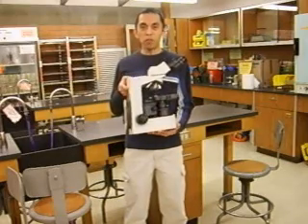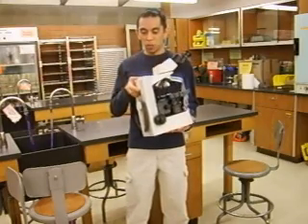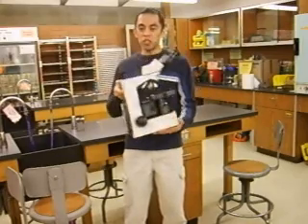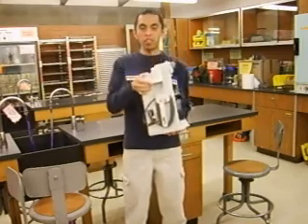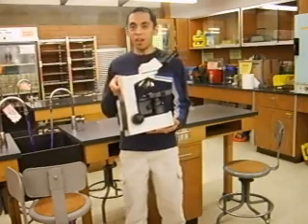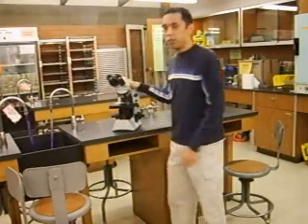The first thing to know when using a microscope is how to grab it correctly. You should always hold it with two hands — one supporting the base and one on the back. There's actually a handle to help you carry the microscope, so always hold it with two hands when carrying it from the cabinet to your work area.